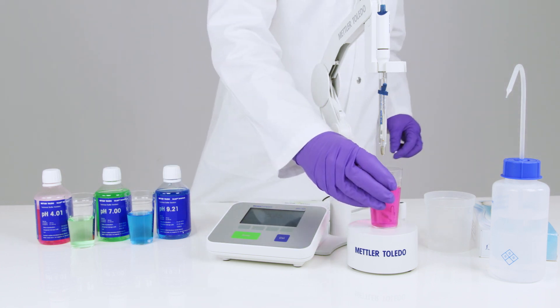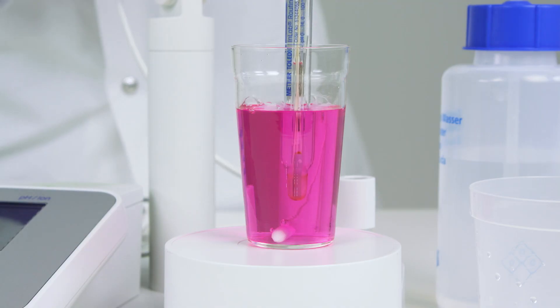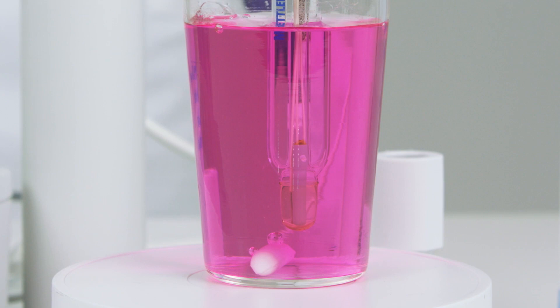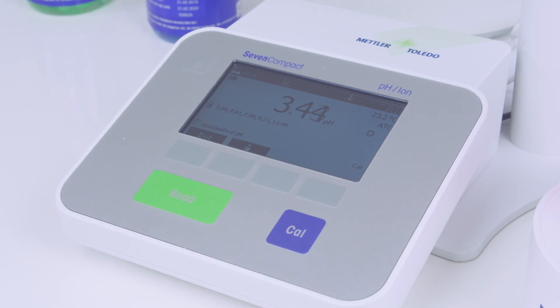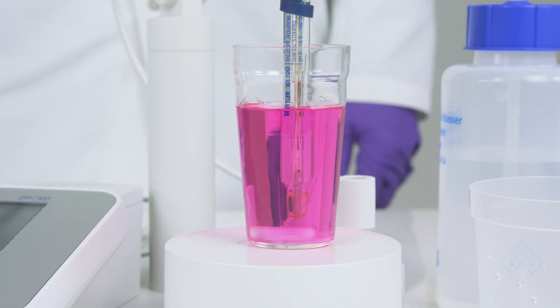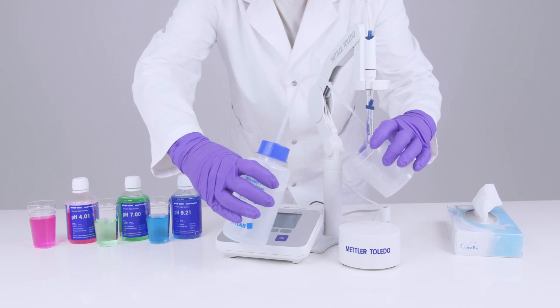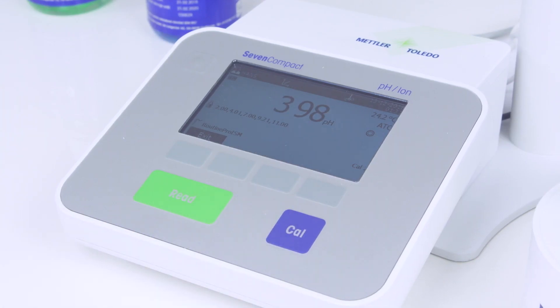Starting with the lowest value pH buffer, lower the sensor tip into the buffer until the diaphragm is fully immersed. As a rule of thumb, the electrolyte inside the sensor should always be at a higher elevation than the sample solution when immersed. Now press Cal to start the calibration of the first point. You'll know when the calibration for this buffer is complete because the flashing A will change to A rooted. Now you can remove the buffer, clean the sensor like before and either save the result or press Cal to continue the multi-point calibration.